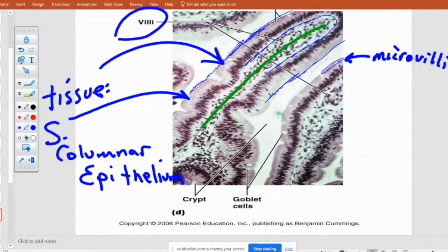Okay. Look, a few little goblets. A little hollow guys. Next picture's got the best goblet cells ever. I mean, the ones for respiratory last time were good. But I think the next one, well, I don't know. Maybe I'm wrong. We'll see.